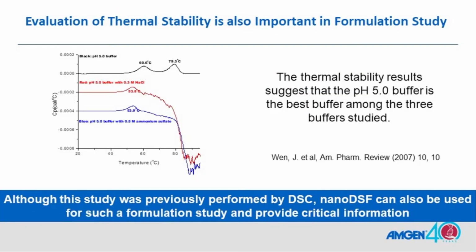Here is the formulation study. In this formulation study, the therapeutic protein candidate was evaluated under different formulation conditions: pH 5.0 buffer, pH 5.0 buffer with sodium chloride, pH 5.0 buffer with ammonium sulfate.